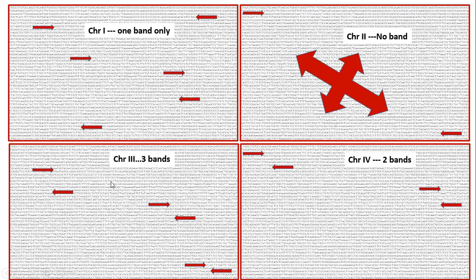And in chromosome 3, very nice pattern. They bind at different locations, very close to each other, forward and reverse. So you may get 3 bands here. Even chromosome 4, 2 bands you may get. So this is nothing but, typically, you are speaking of RAPD technology.